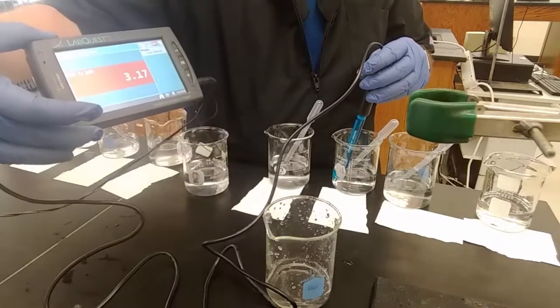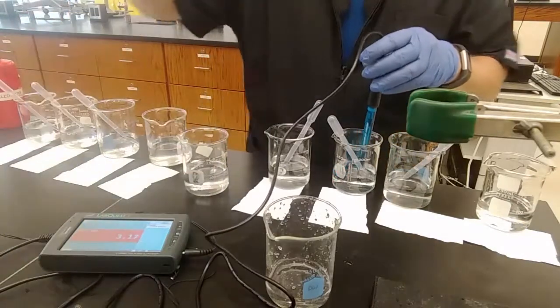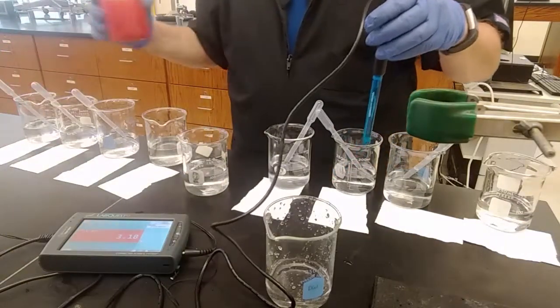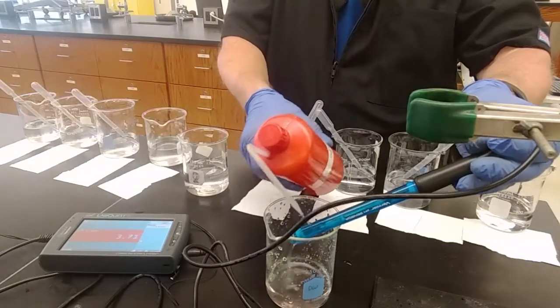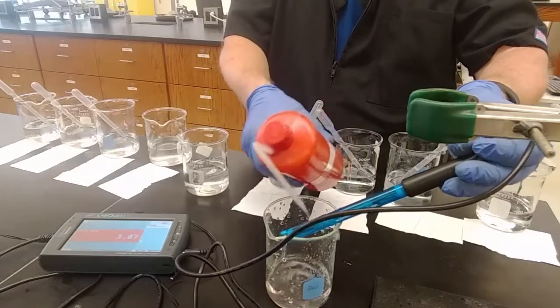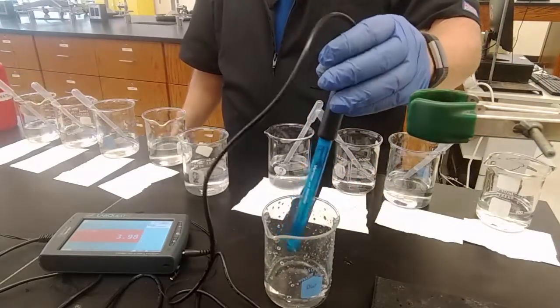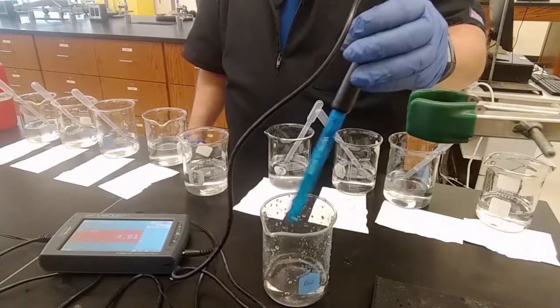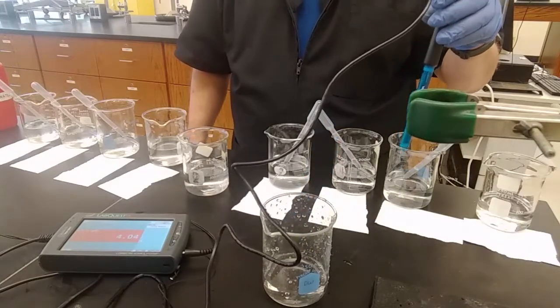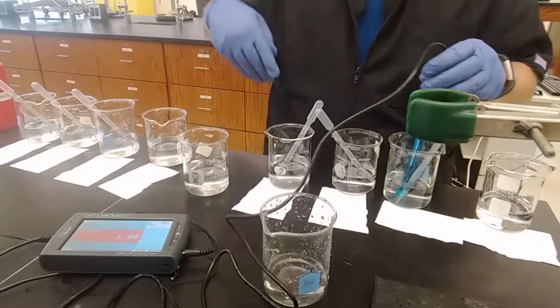3.17, let's say. 3.17, we were expecting 3, so that's our first one that's close. Remember, every 1 unit pH change is a change 10 times concentration. Just like sound pressure level, decibels, is a 10 times change for every 1 unit. All right, we're expecting pH 1 here, based on our concentration and our dilution.